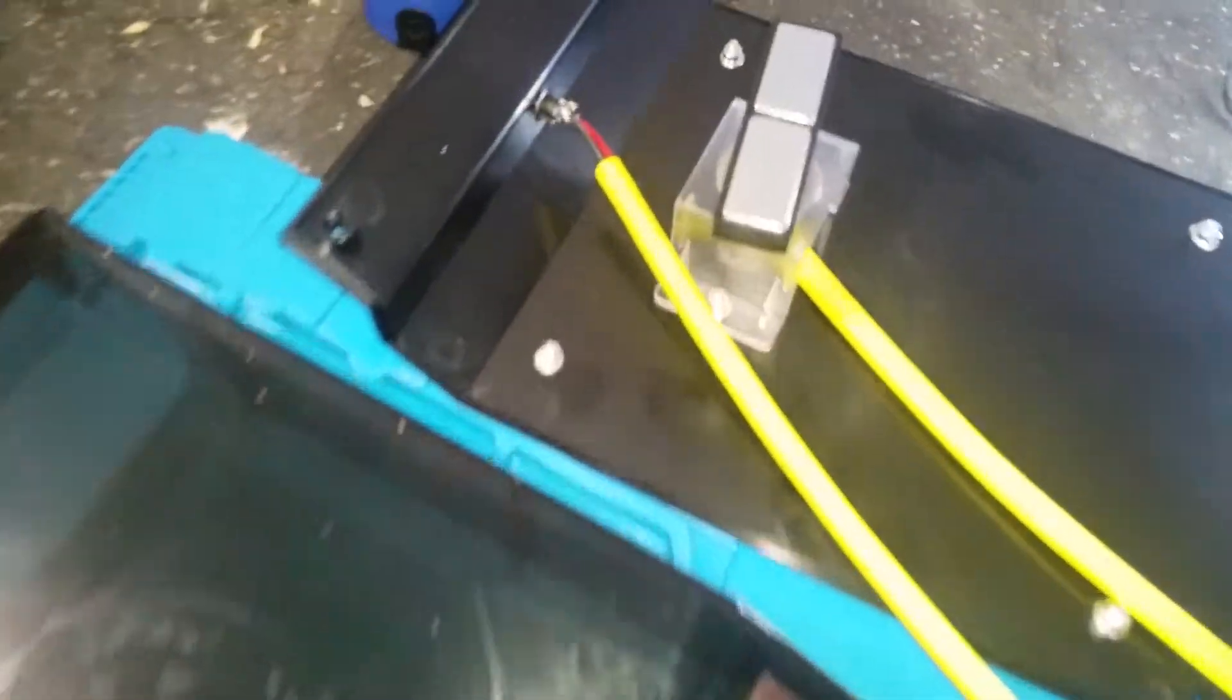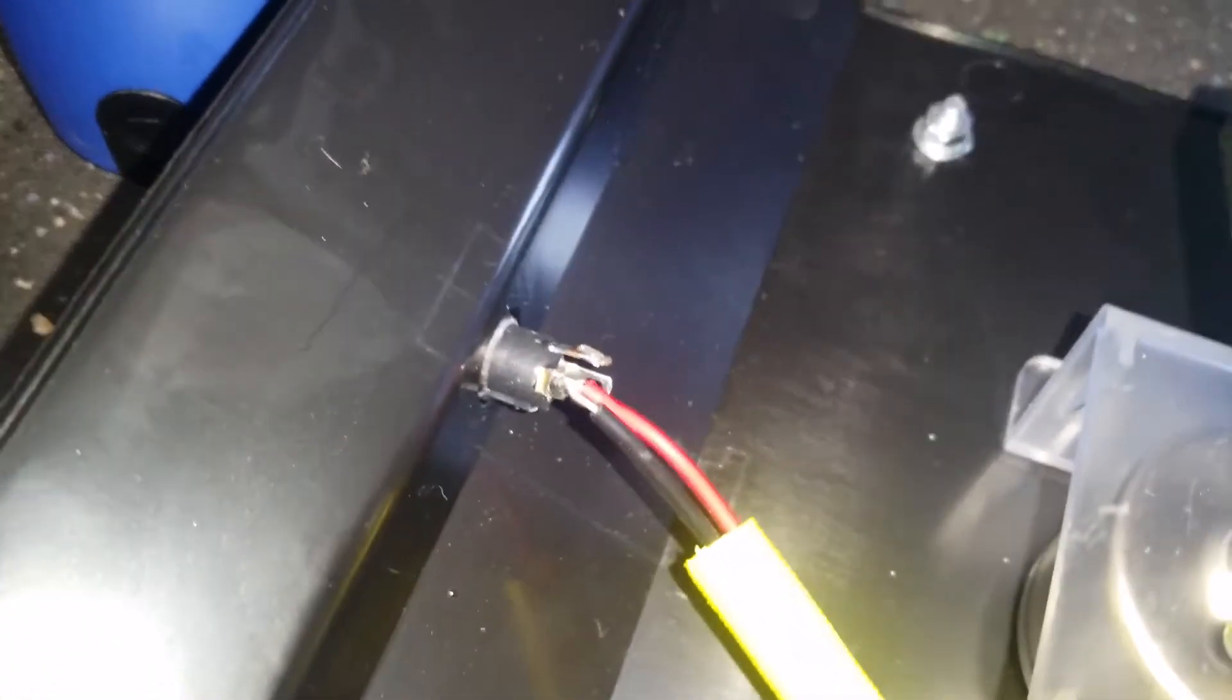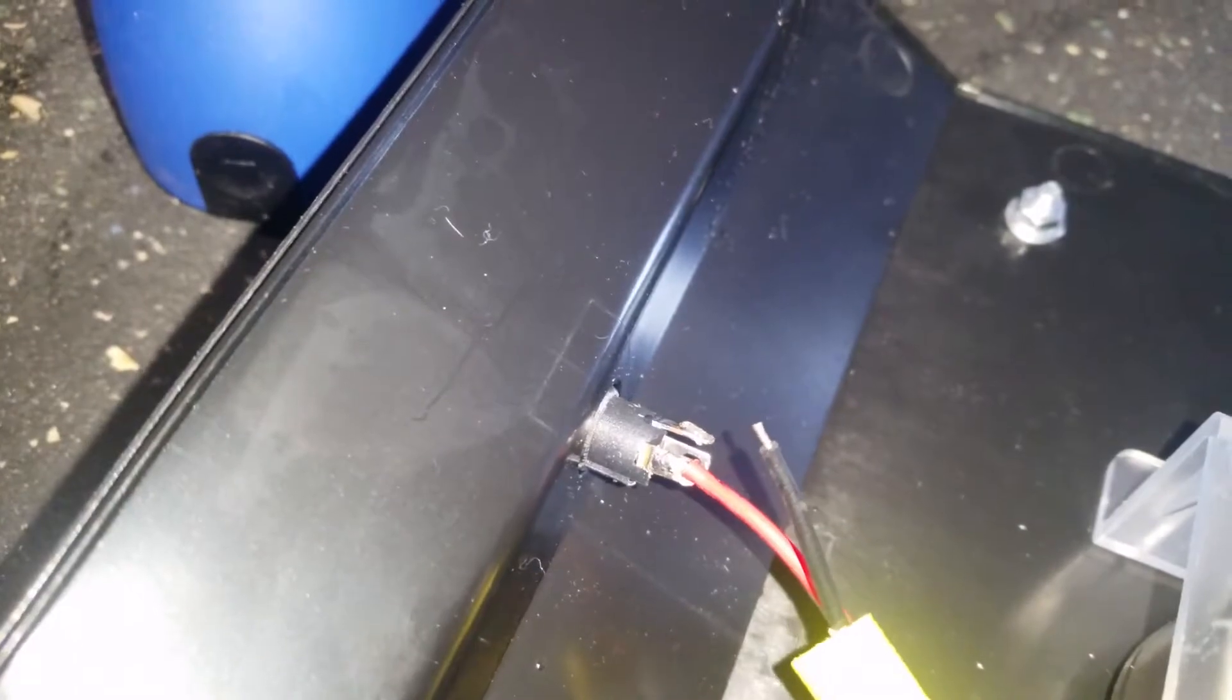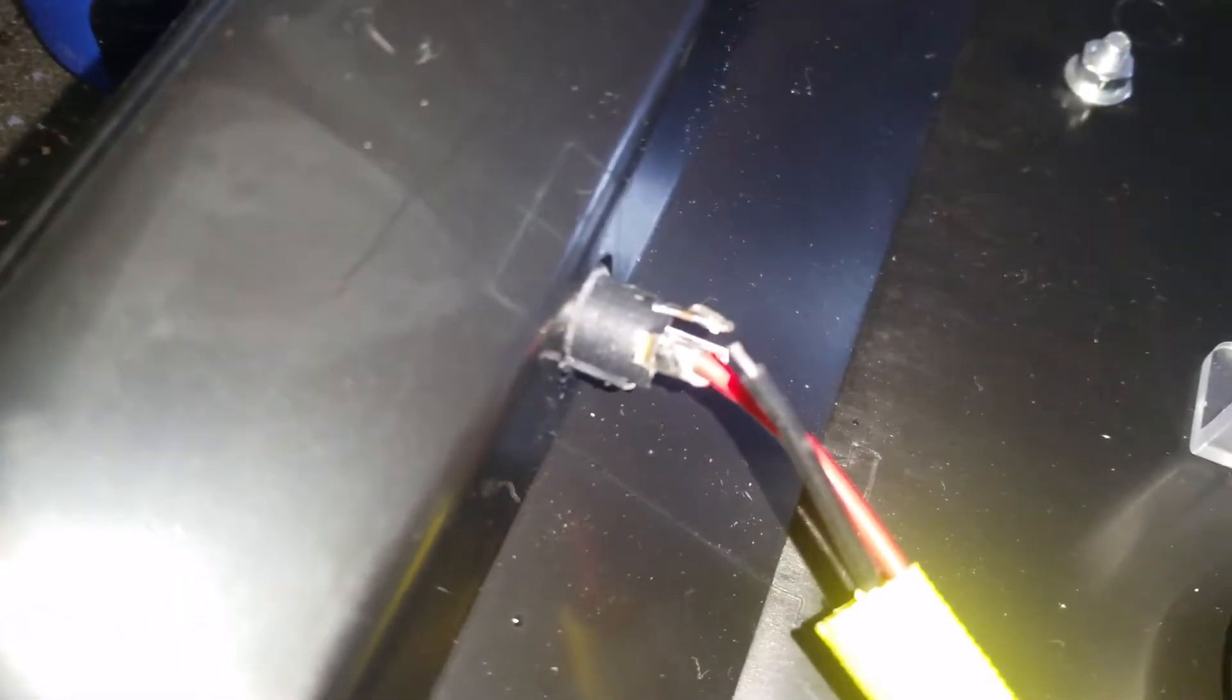The number one thing I found when I opened it up, take a look at this, hopefully it will focus. That wire, it's not even tinned.